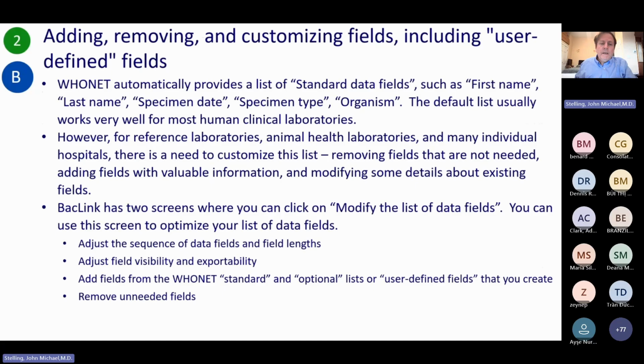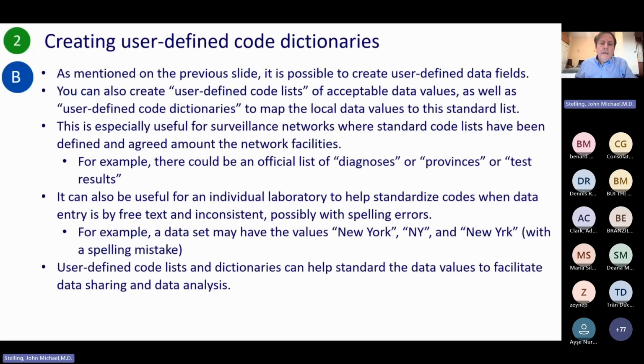Good. Next slide. Creating user-defined dictionaries. As mentioned in the previous slide, it is possible to create user-defined data fields. Look at the timer, okay? You can also define user-defined code lists of acceptable values, as well as user-defined code dictionaries to map local values.